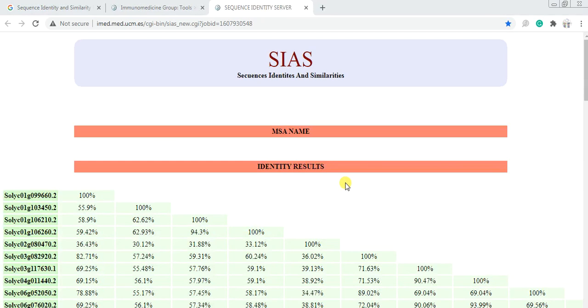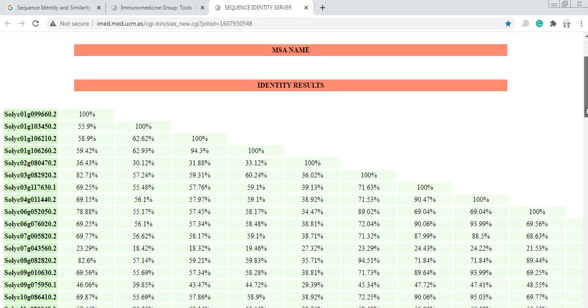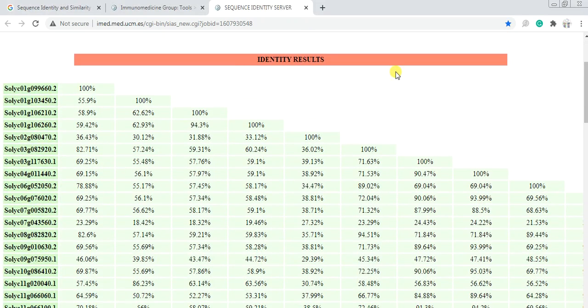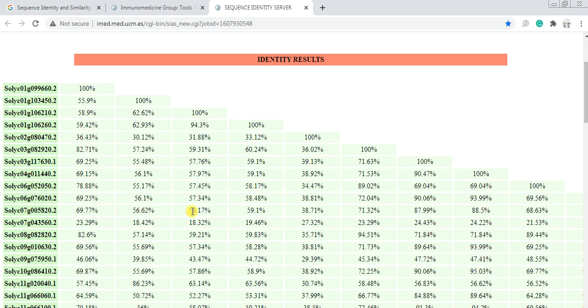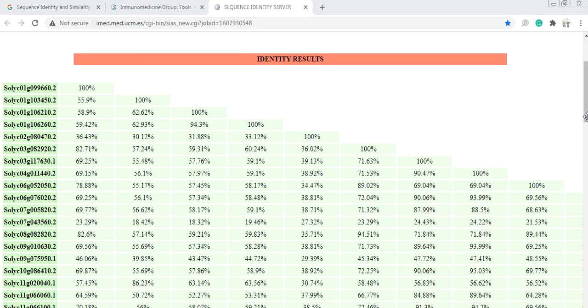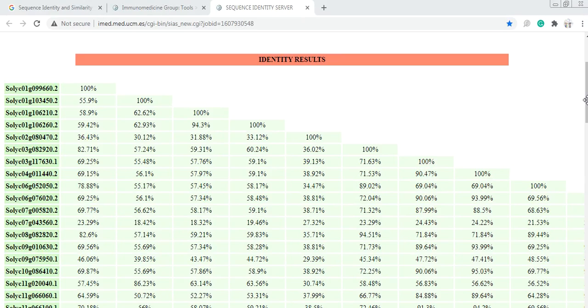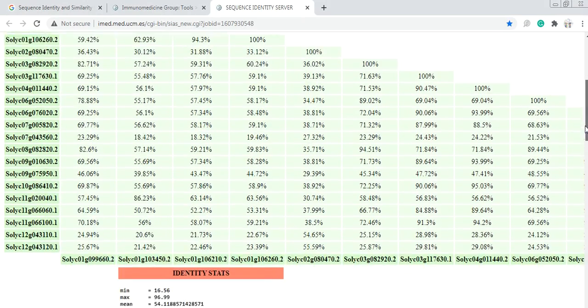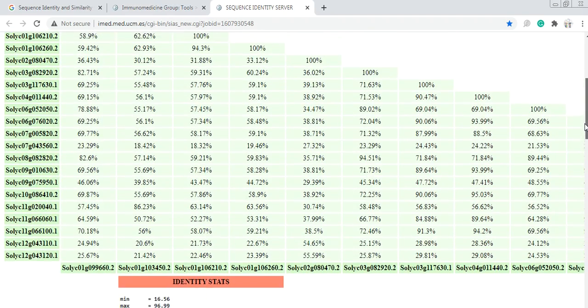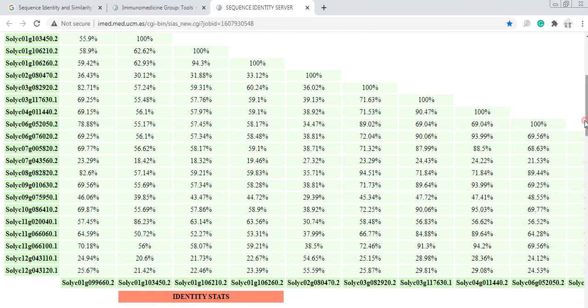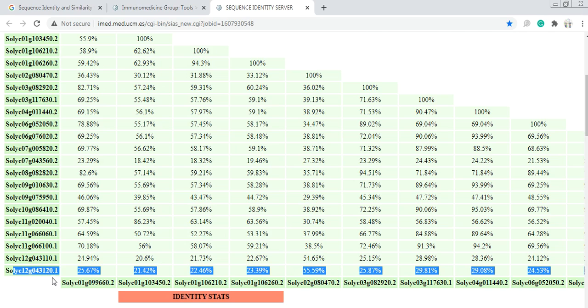When the process is finished, it will give you tables. This is the identity table showing how these genes are identical to one another and their percentages. These are the gene names, and this shows how much this gene is identical to this gene.